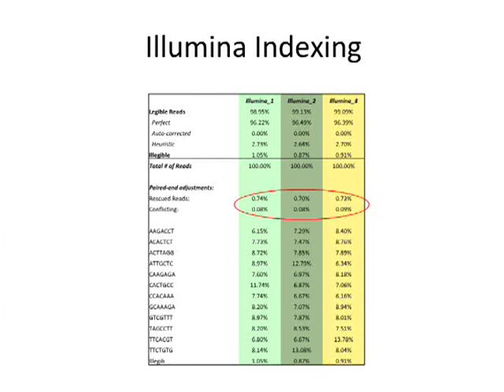Then finally, I'll skip over this slide. This is simply to indicate that some of you may be aware of this, that there is an error rate that's associated with Illumina indexing. It hovers at around 0.08, 0.09%. What this means is that the correct index, which is done in a separate read on the Illumina system. So Illumina has 3 reads, which would be the first end read, then the paired read, as well as a third read that reads the index, and then based on that index data, those 3 reads are placed together to identify an individual sample.